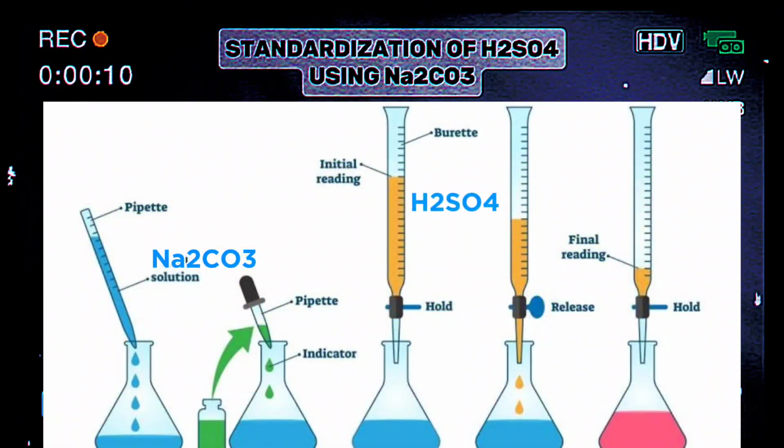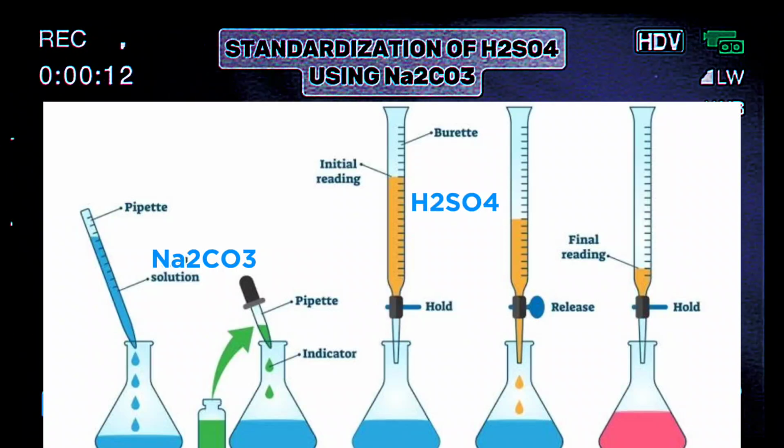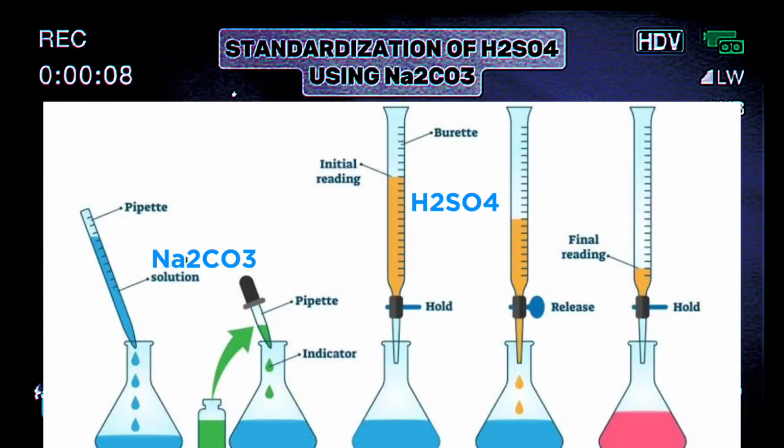So you have to make a calculation and prepare the same solution in 250, meaning it's also the same concentration. All this we've already covered in our previous experiment. So how would you prepare the 250 cm cube of the 0.05 molar standard solution of sodium trioxocarbonate(IV)? Once you're able to do that, that is what you would employ to carry out this experiment.